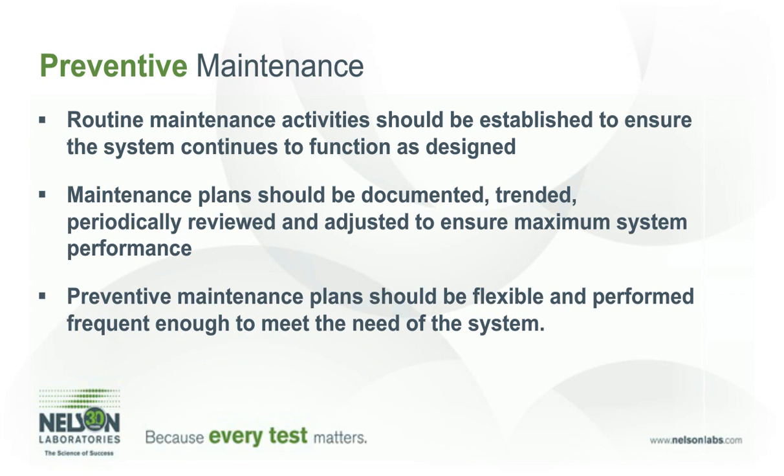Process controls are not limited to monitoring and trending of data. Adherence to a strict preventive maintenance program is of equal importance in maintaining the operational state of a high-quality water system. Water system maintenance should never be scheduled on an as-needed or reactive basis.